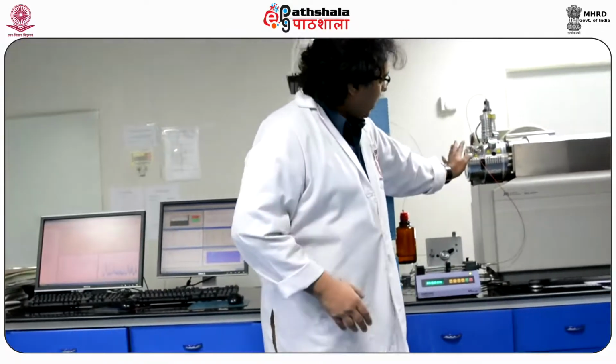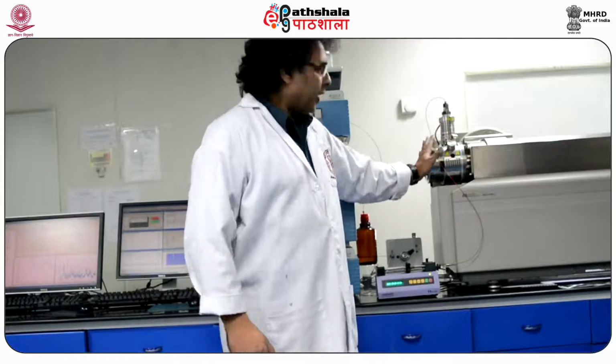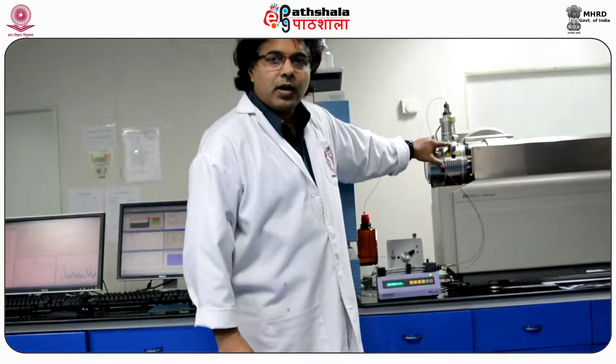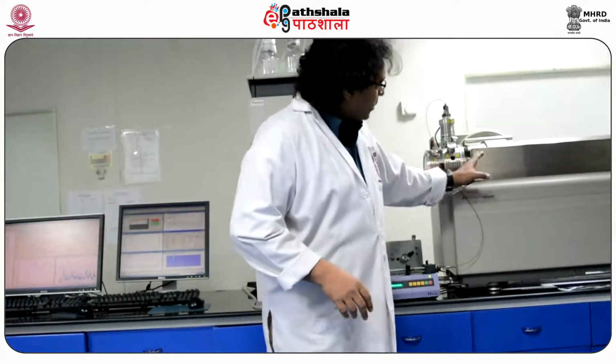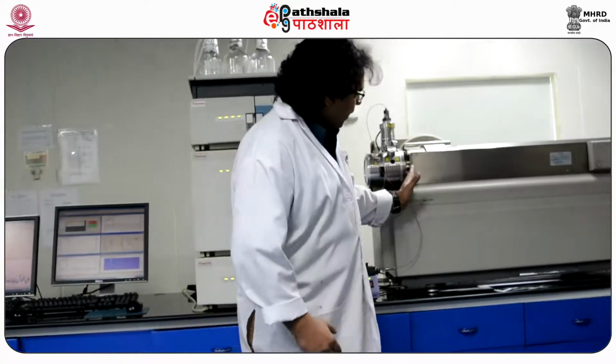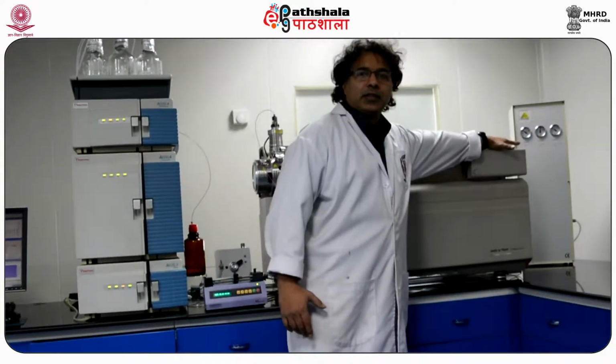What you see here, as I already explained, is the ESI, the electrospray ionization probe, in which the sample is constantly being fed. Here is the heater, which heats the gases coming inside, where the sample is getting nebulized. Here the charge mediated separation happens, and the ions are focused towards the quadrupoles. Quadrupoles are kept in this range. The first quadrupole is here, the second quadrupole here, and the third quadrupole is here, finally followed by the detector.